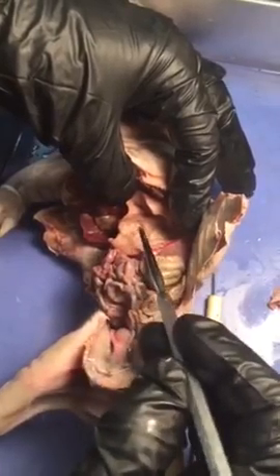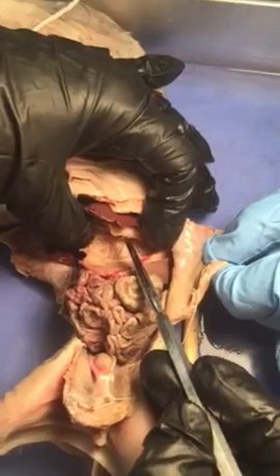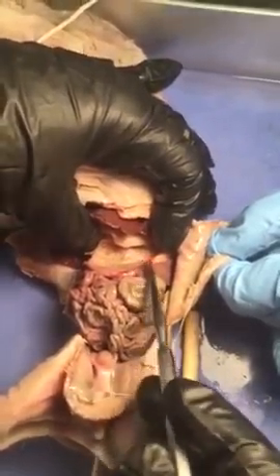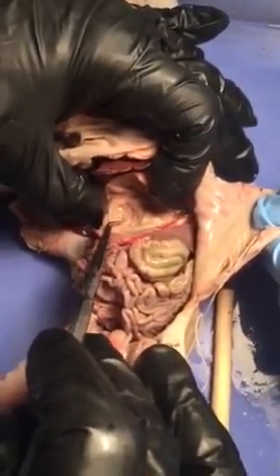Can any of you see what I'm doing? No. I feel like I'm doing this solely for the video. Which is okay, but then you guys should probably just be working on your pigs. If you're not able to really watch what I'm doing right now, you're going to watch it later. Okay, but can you see how all of this is coming together here?